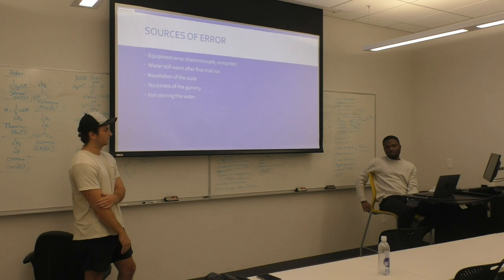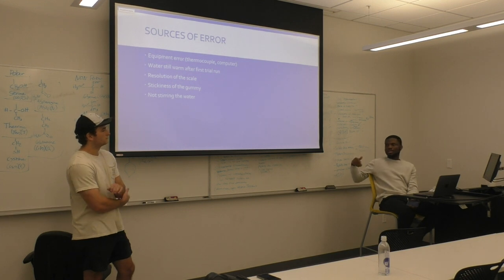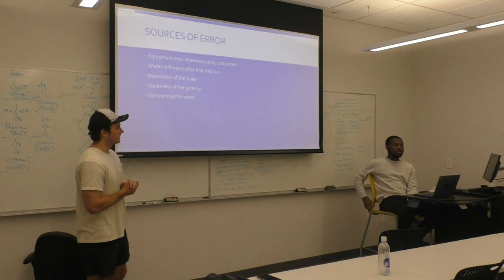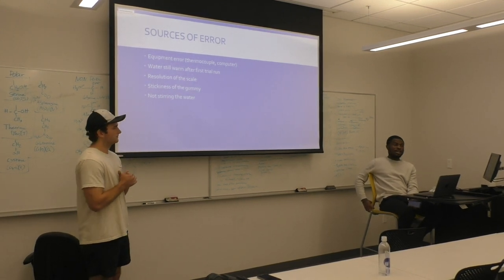Okay. I think the heating value for benzoic acid corresponds to the standard value, which is 26 megajoules. Right, which is correct. Oh yeah, that's a given. Exactly, that's not calculated, it's just given. Right, and then you use that to find it. Yeah, I think it's fine.